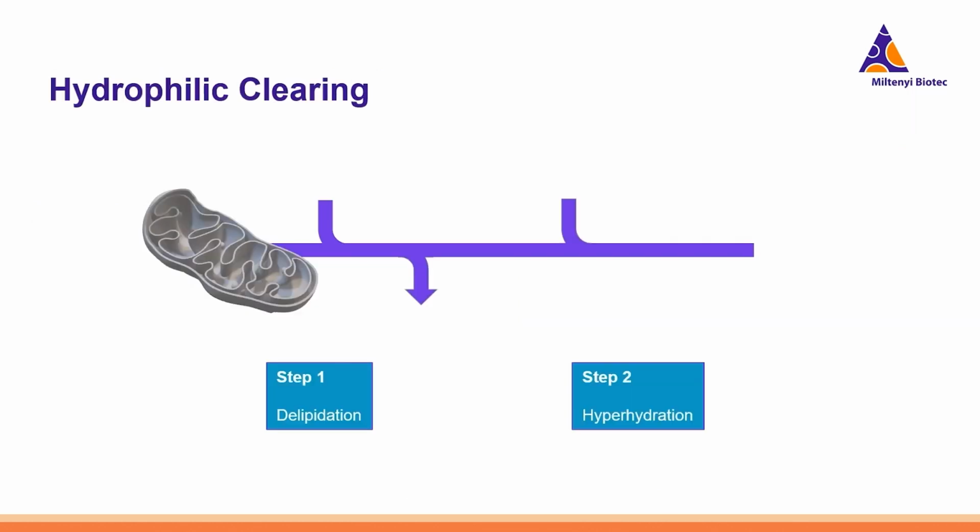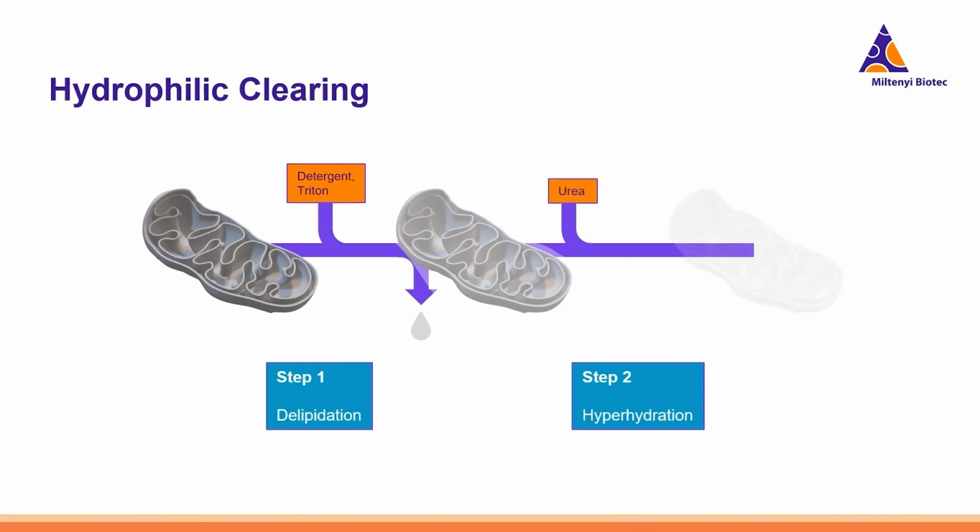Hydrophilic clearing techniques start by removing lipids with some form of detergent. The samples are then placed into high concentration urea solution and imaged in an RI-matched aqueous immersion. The resulting refractive index of samples cleared in this method ranges from about 1.38 to 1.48. So these methods are typically quite simple and can clear tissues rather well, while also preserving endogenous fluorescence.